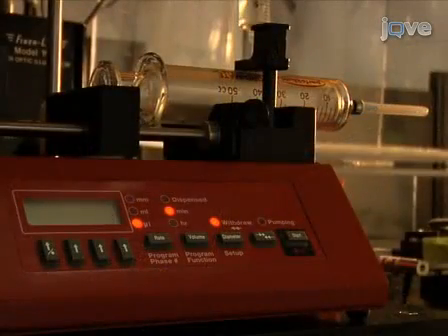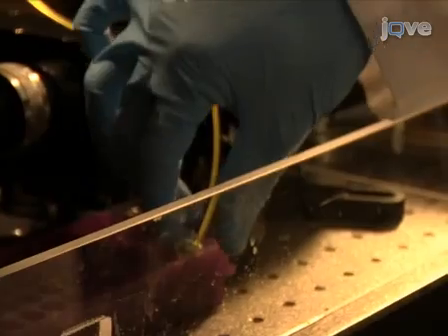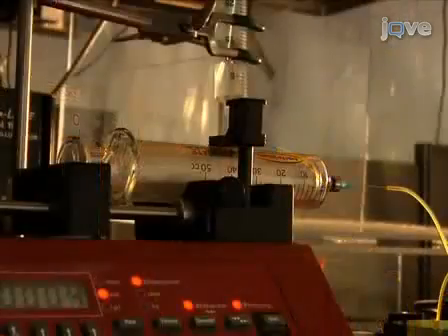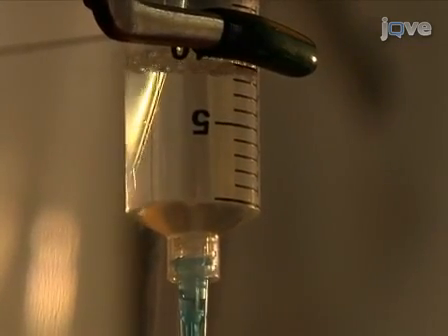Then, using a mechanical syringe pump to control the flow rate, flow the IB through the channel at a constant rate of 5 microliters per minute. Bubble argon gas into the IB reservoir to prevent atmospheric oxygen from dissolving into the buffer.